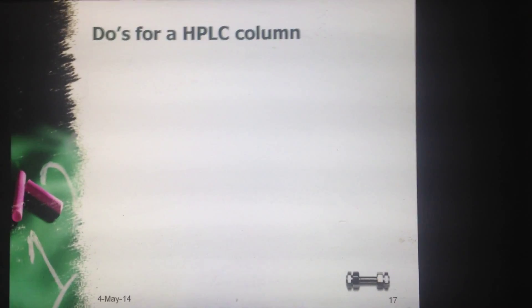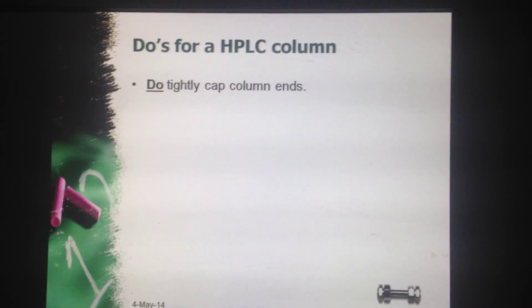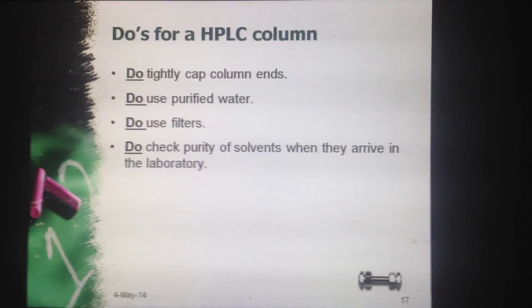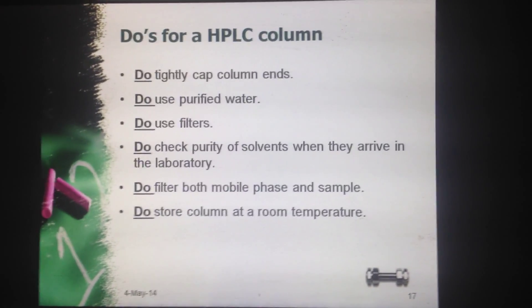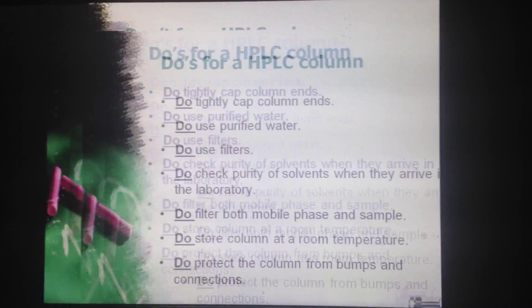Do's for the HPLC column: do tightly cap column ends; do use purified water; do use filters; do check the purity of solvents when they arrive in the lab; do filter both mobile phase and sample; do store the column at room temperature; and do protect the column from bumps and connections.